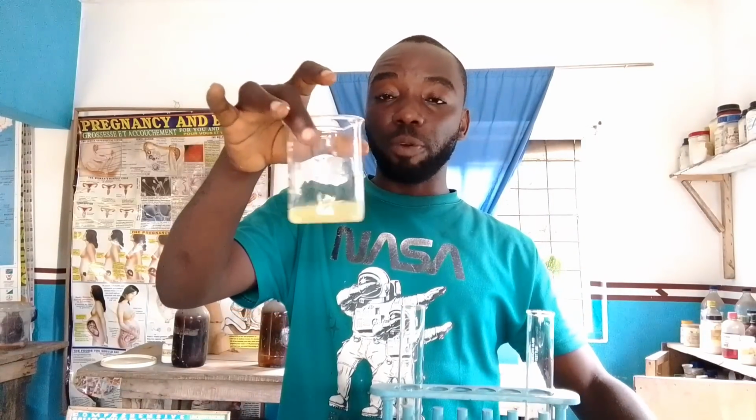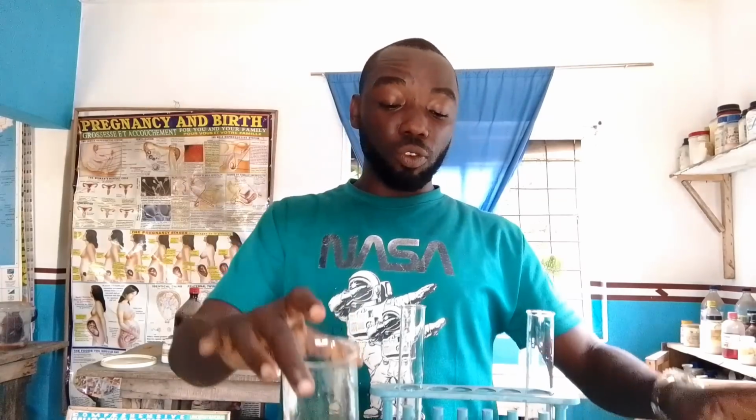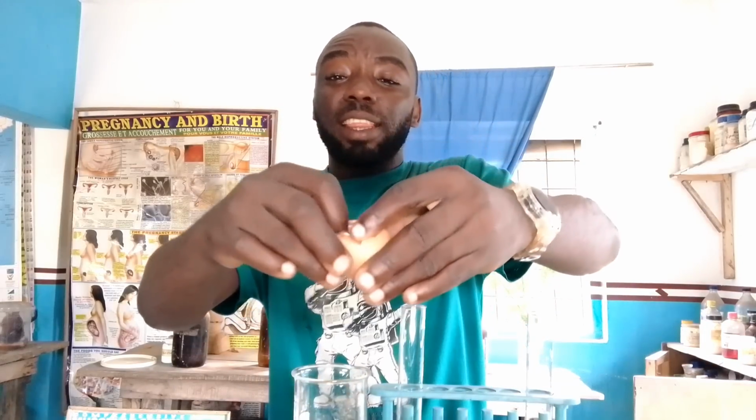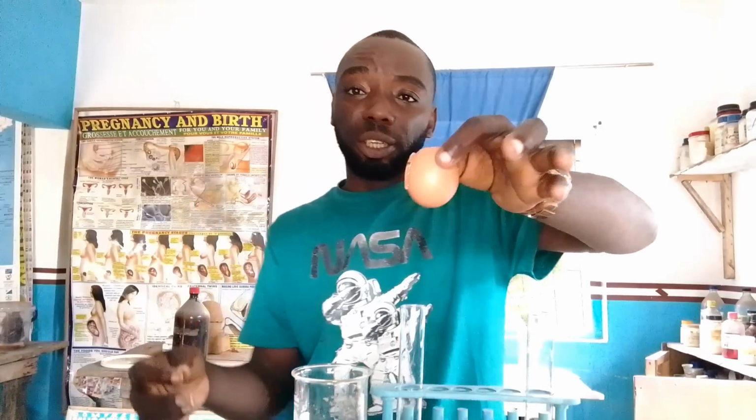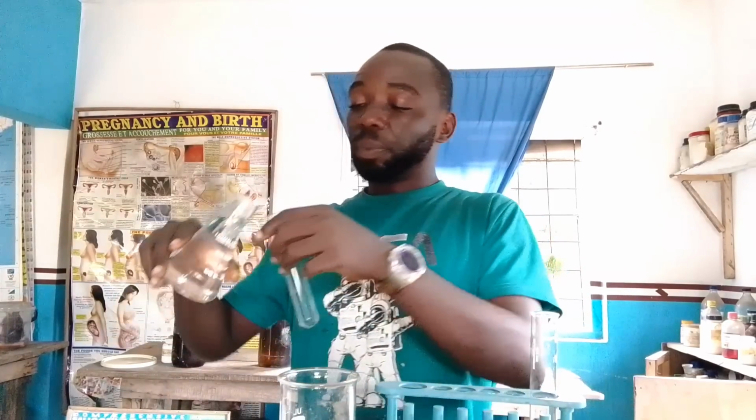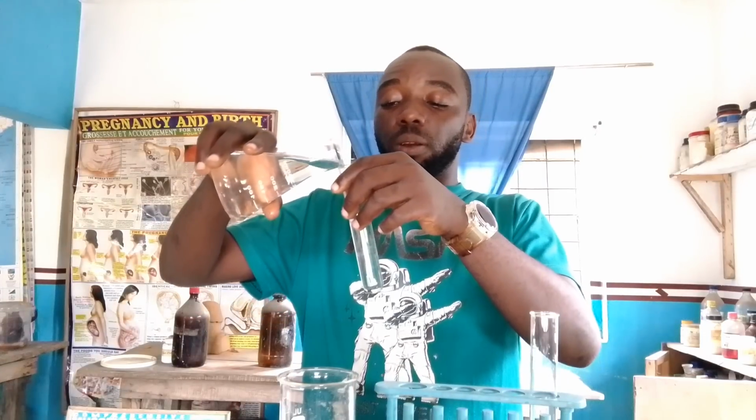As you can see, we only extracted the egg albumin, that is the egg white. There is no yolk in it. The yolk is still intact in the egg shell. So we have to discard this, as it now has no usefulness. So look at the one we are going to be using now. Remember, we were asked to provide 3 ml of water, which is specimen H. Now look at this. Let us use this one as our 3 ml of water.